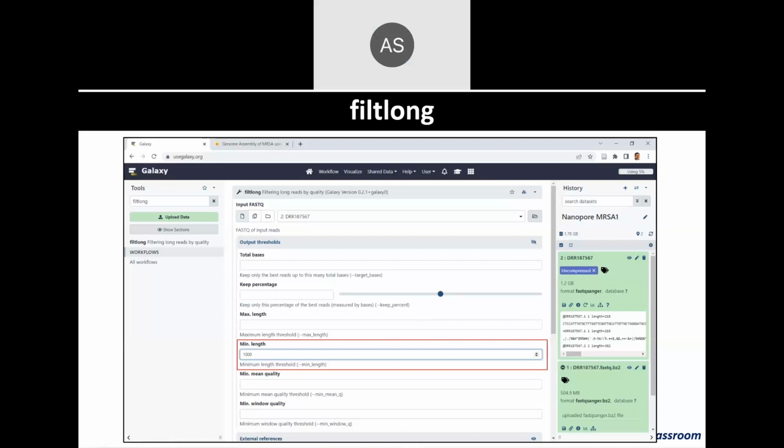So if you have paired end reads, you'll have to specify that you have paired end reads, and when you do with paired end reads, you have basically two different files. One is mentioned as _1 for the forward read, and the other can be mentioned as _2 for the reverse read, right? And then of course you pair them together. So there is a process of pairing up files together so that the two files move together. But that is a bit complicated. We'll not go there for now.